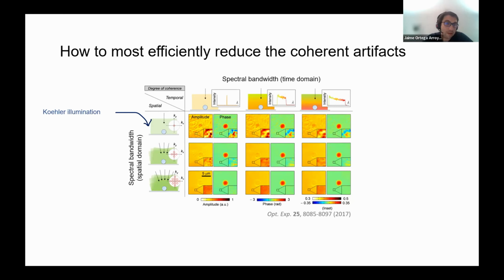And there have been several implementations of this throughout the years. You can do this by scanning your beam using AODs. You can also implement confocal scanning ISCAT or spinning disk confocal. And these are topics that were covered in the previous seminars by Vahid and Chia-Lung. So I would like people to refer to that.